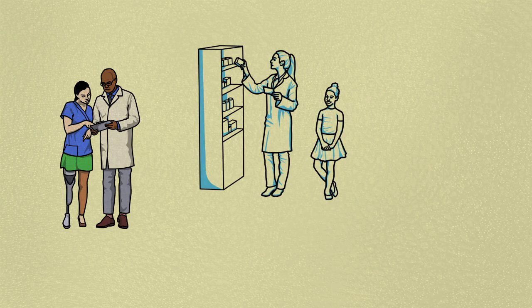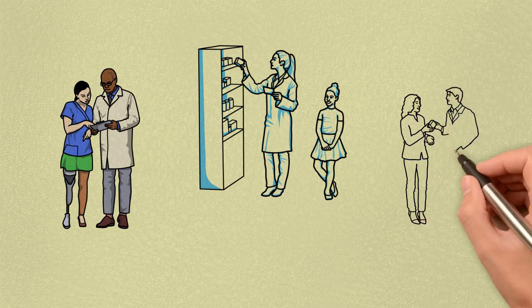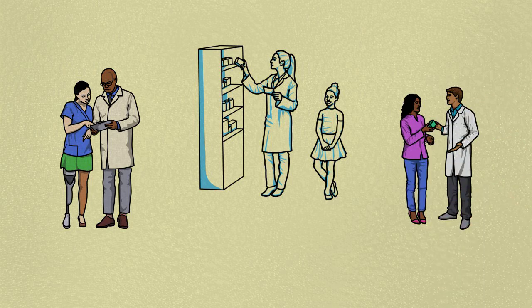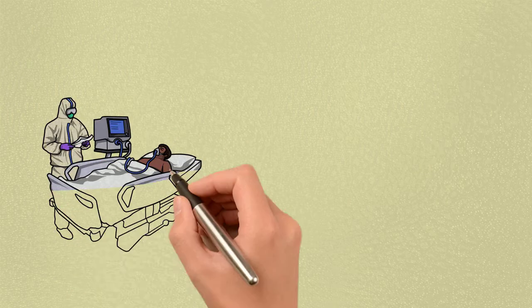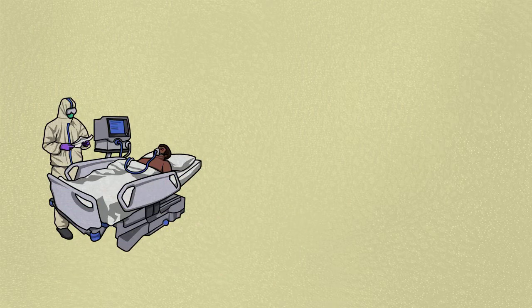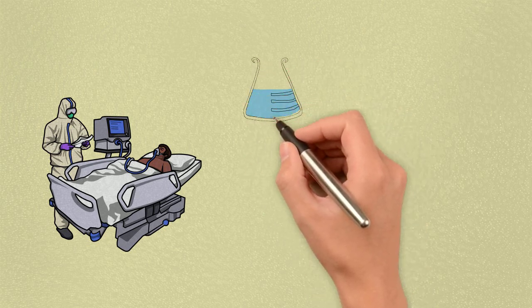It cannot identify bacteria to the species level, and for most medical conditions, it should not be used as the sole method of bacterial identification. In clinical microbiology laboratories, it is used in combination with other traditional and molecular techniques to identify bacteria.